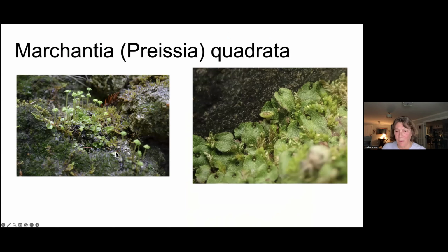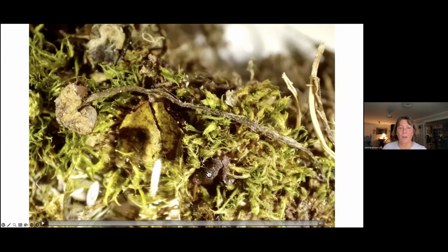It's now called Marchantia, and it's typical. You've got these stalks with the female reproductive structures and stalks with the males, and then the surface of the thallus is sort of reptilian. And this is what we're going to focus on. They're so pretty when they're alive. When they're dead, not so much. I think maybe this is why I don't really like working on these nearly as well.